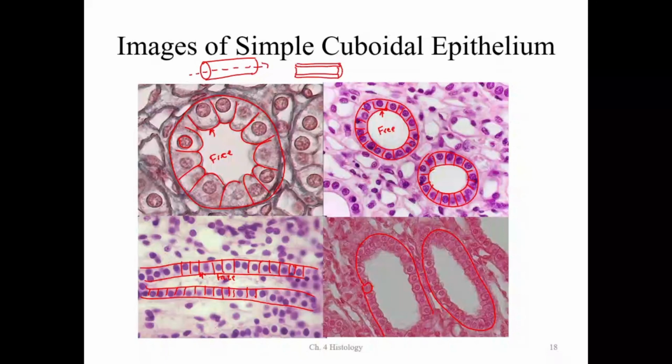And this edge right here is what we're seeing right there. That makes sense. All right, so I like to tell you what you're seeing.